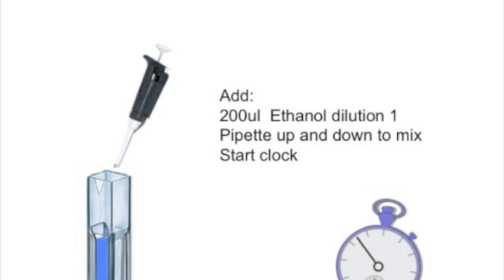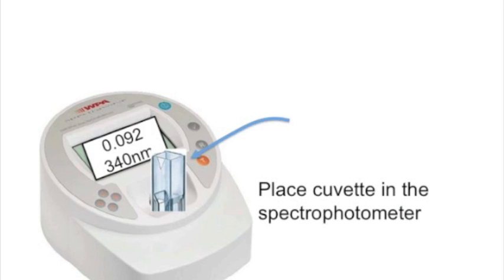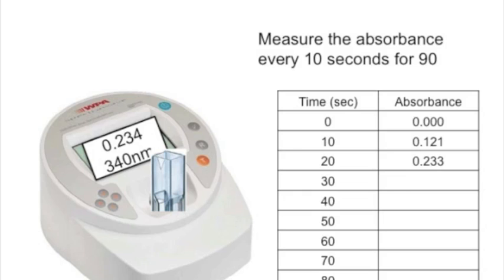Then take out the cuvette, add 200 µl of the ethanol dilution, tap it up and down to mix, and immediately start the clock, because at this point your reaction has started. Put the cuvette back into the spectrophotometer and start reading the absorbance every 10 seconds — you are following the production of NADH as it happens — and carry on for 90 seconds.